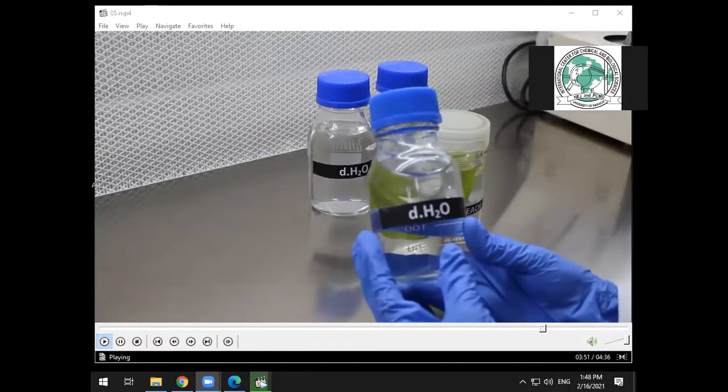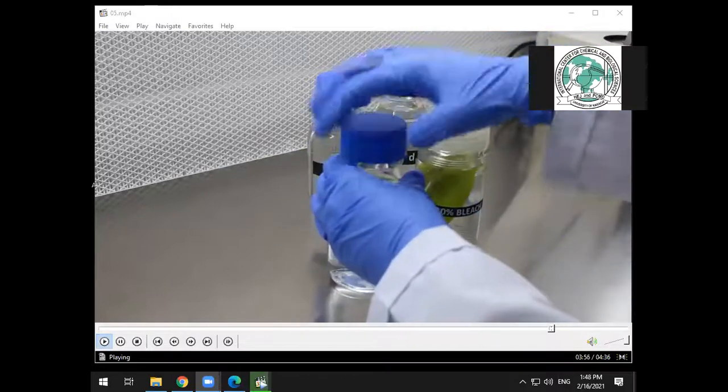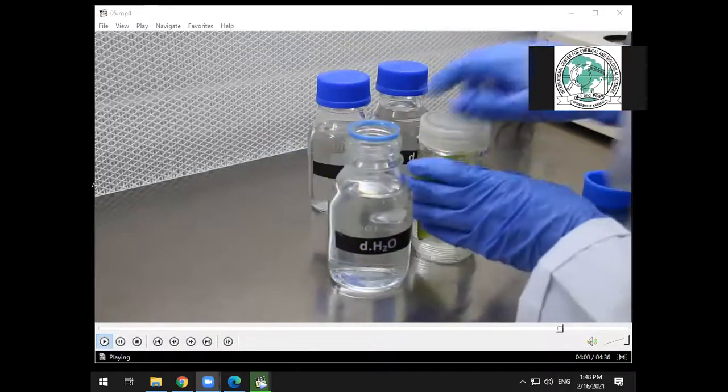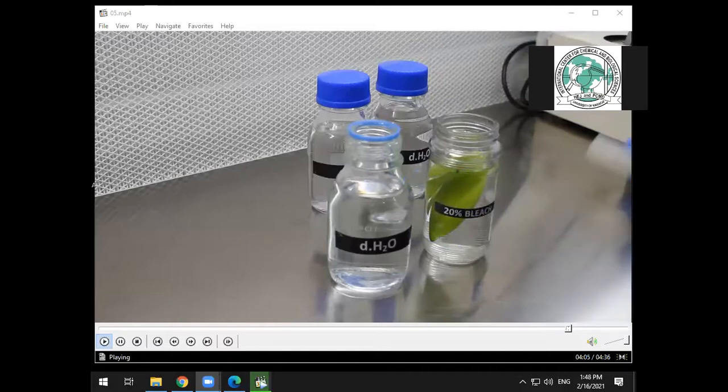After sterilization, explant will be washed with autoclaved distilled water 3 to 4 times in order to remove the traces of ethanol and bleach.